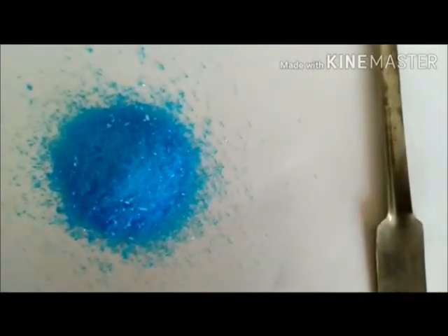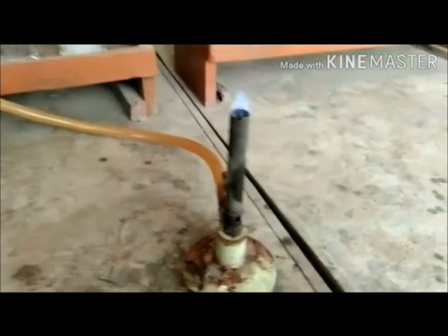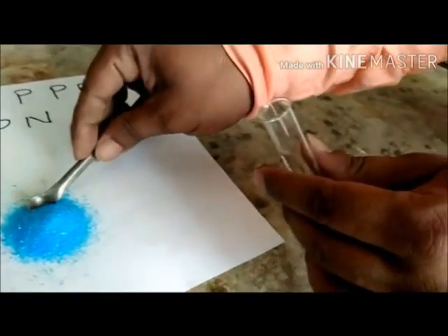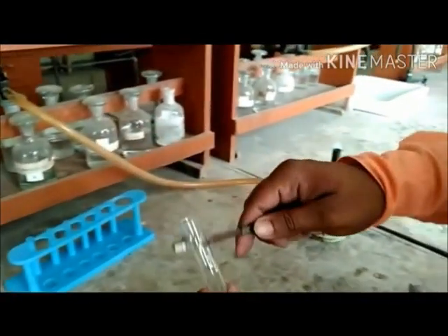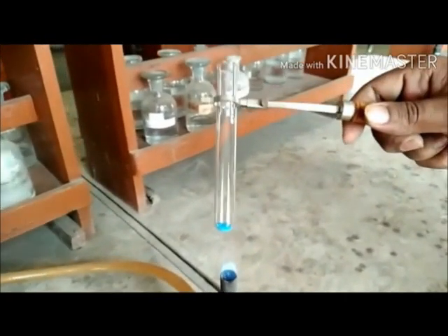In this experiment we have taken a salt containing copper, and that is copper sulfate. We have a test tube holder, a test tube, and a Bunsen burner. We take a test tube and put one spatula of copper sulfate in it. As you can observe, the color of hydrated copper sulfate is blue. We hold the test tube with a test tube holder and place it on the flame of a burner.